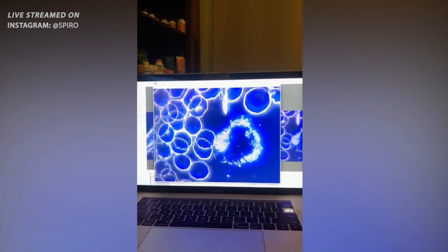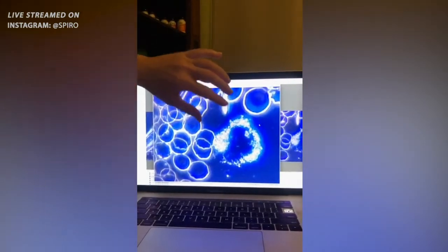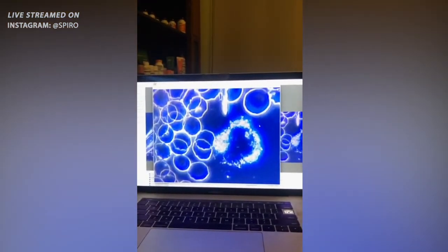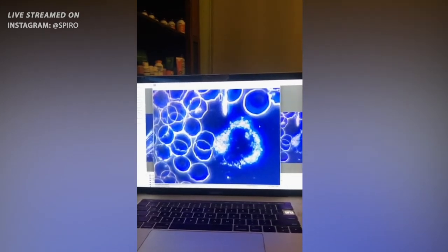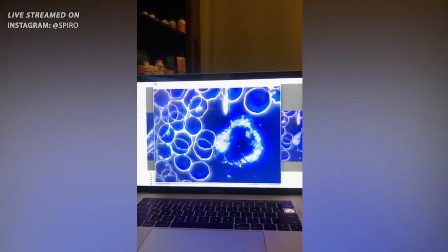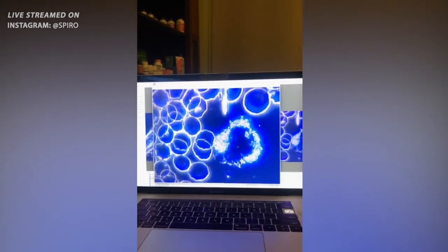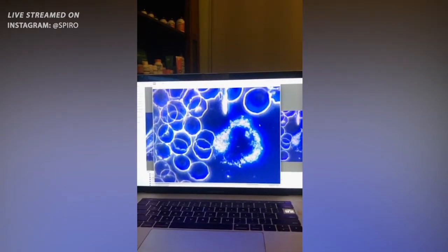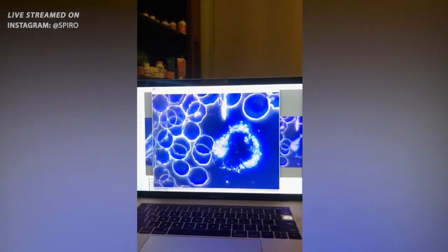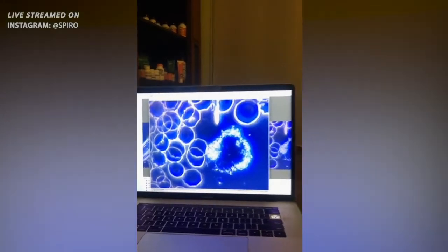And this is actually a white blood cell which is completely destroyed, which I have only seen in people after receiving chemotherapy or some similar very toxic treatment. So again, it's very damaging to the red and white blood cells. This is not normal. The membrane of the blood cells in a vaxxed person has been completely corrupted.